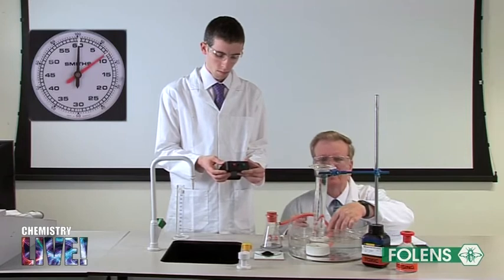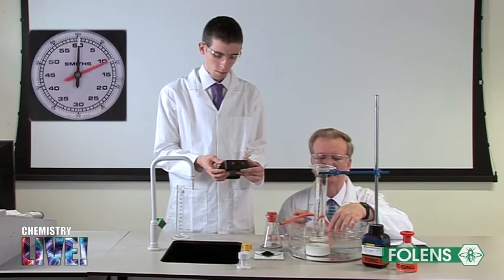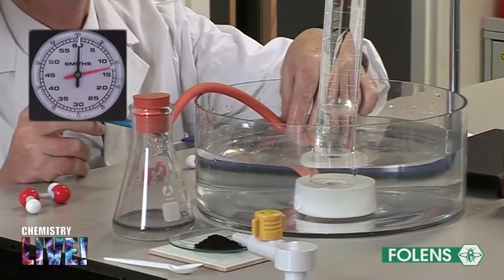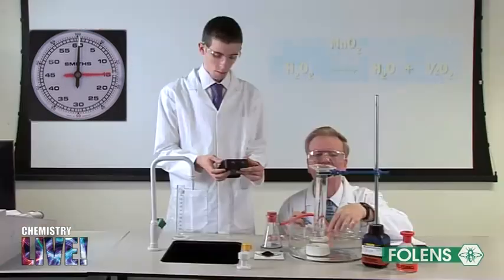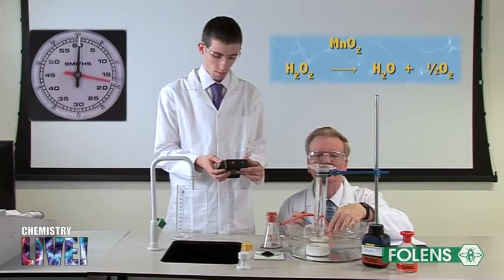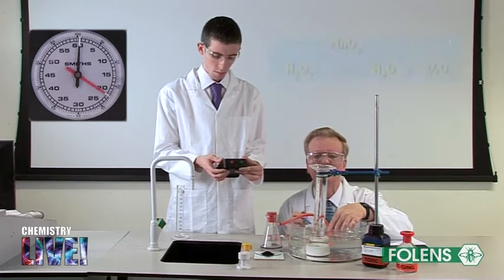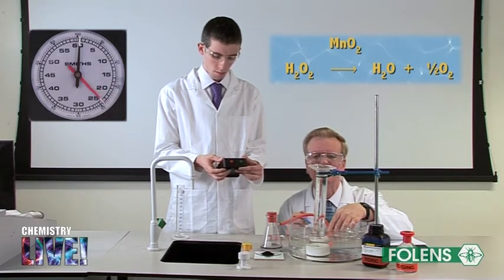We see that oxygen begins to come off since the hydrogen peroxide is decomposing into water and oxygen according to the equation shown on the screen. At half minute intervals, tell your partner to read the volume of the gas in the graduated cylinder.